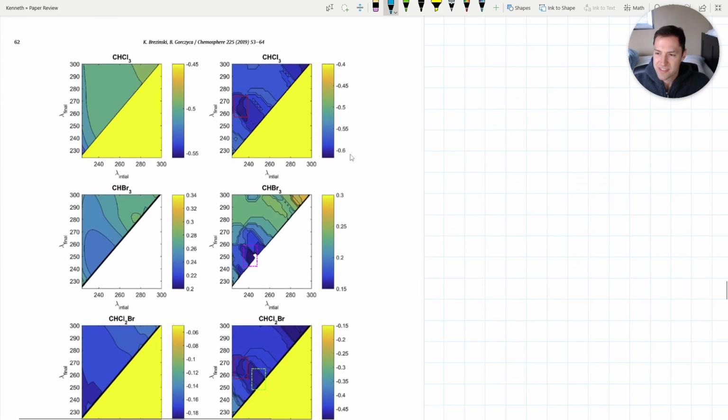And then we sort of saw something interesting where this is actually closer to, who knows, 0.62 or something, which is quite high. And at least with chloroform here, we notice that there's this broad area, which again is between initial of 230 and 265. So this is just telling us, hey, as our academic contribution, maybe it's these particular ranges that we should focus on.